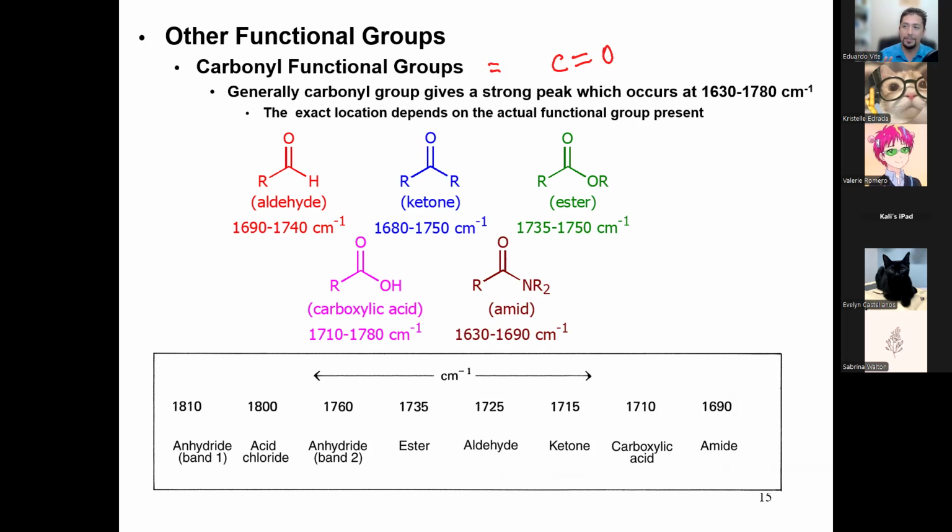Are we okay with that concept? You learned a new word today. That is carbonyl. Carbonyl is like iconic. It's like Bugs Bunny. It's like SpongeBob. Whenever you do IR spectra, if you learn nothing else, you should at least know that's a carbonyl peak at 1700, right? The mitochondria is the powerhouse of the cell. Well, the carbonyl is always at 1700. Very strong, intense peak.